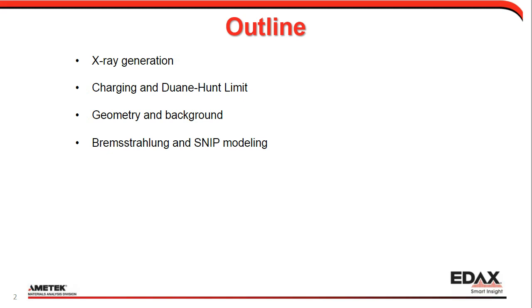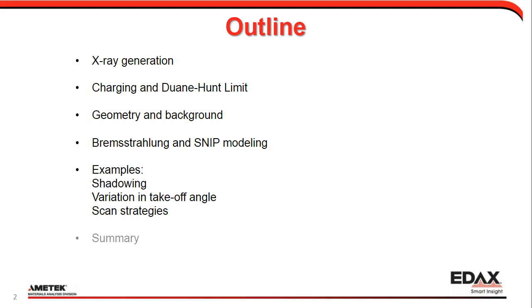And after that, we'll hand over to Shangsheng, where he will go through some examples showing these changes or anomalies in the background, and a few things about what can be done to basically get around the problem, or at least figure out what the problem is. And we'll end up with a summary.